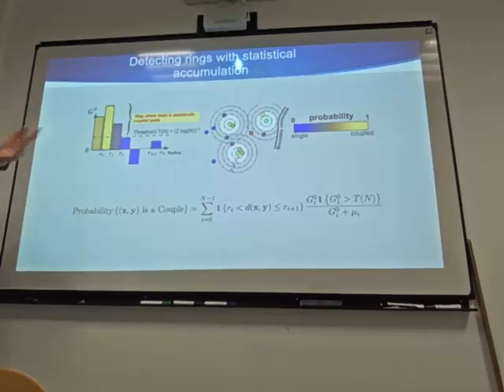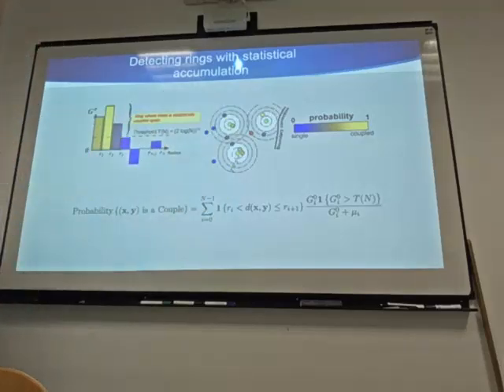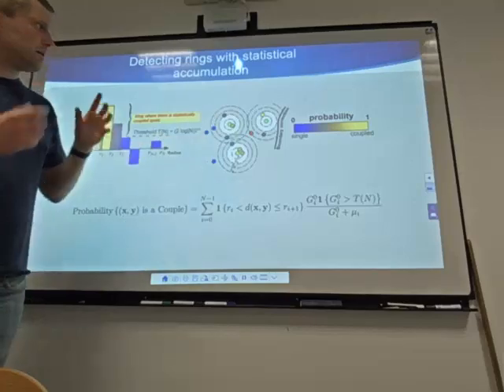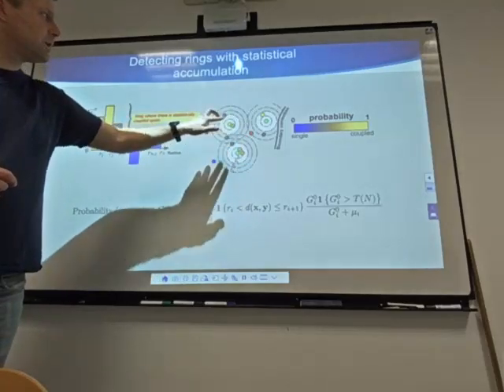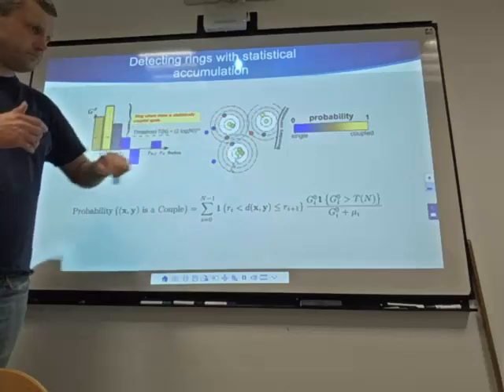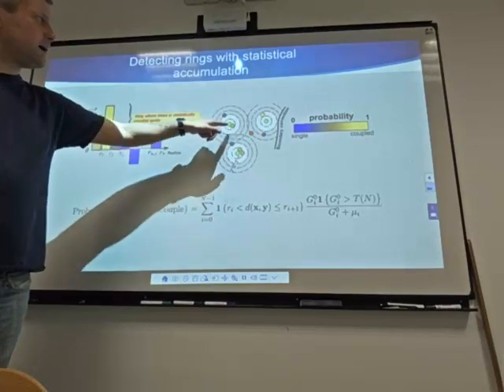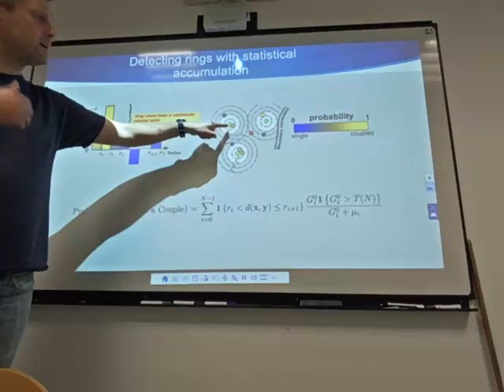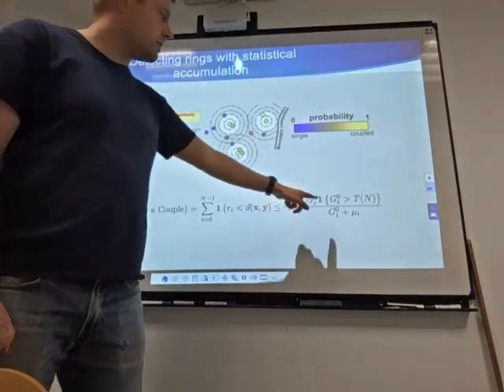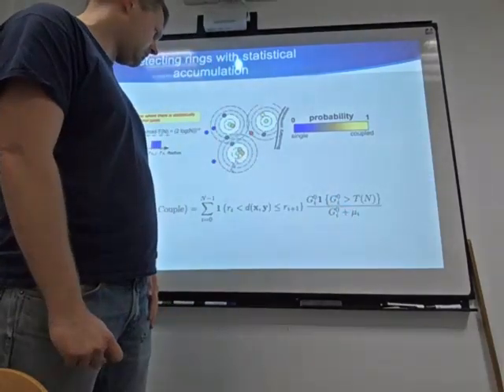And then, because you know for each ring if you have a significant number and how many objects you have, you can then define a probability for each couple. So for example, for these two, there is a probability that they are associated, which is how many objects I have in these rings divided by how many I expect. So this is here. This is G0i, this is the number of objects, G0i plus mu i, I'm a bit lost.